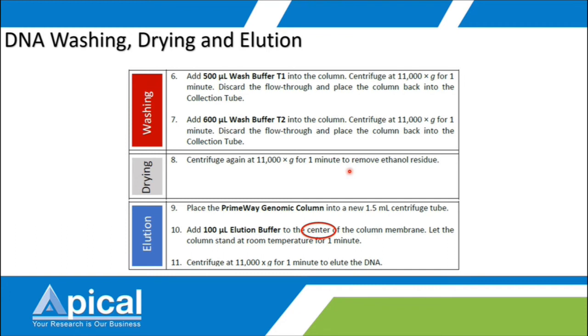And in the elution step, you need to put the elution buffer at the center of the column, so that it will make sure the elution buffer has covered the whole column. Then it will increase the recovery rate. But do not poke the column and do not break it. As for the volume of the elution buffer, I will say always follow the volume recommended by the kit.